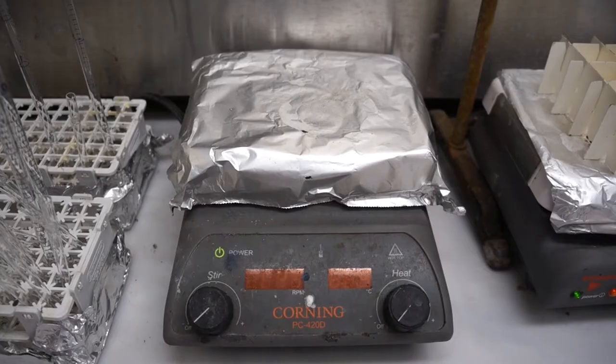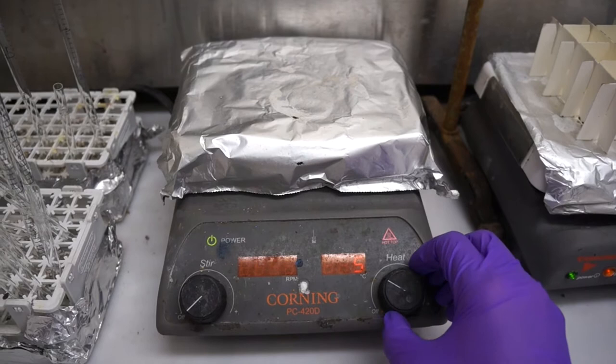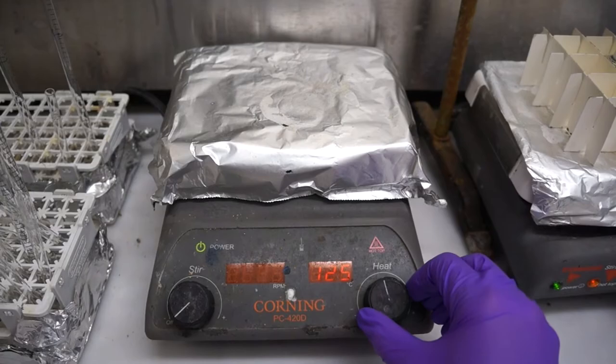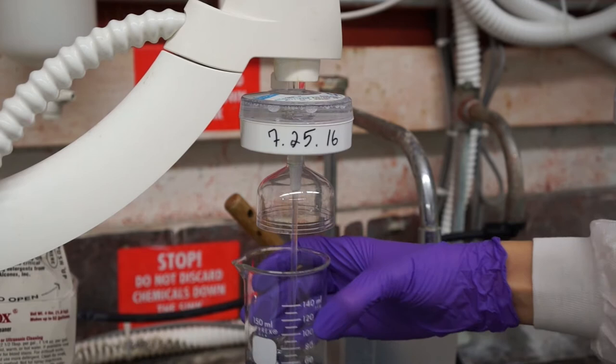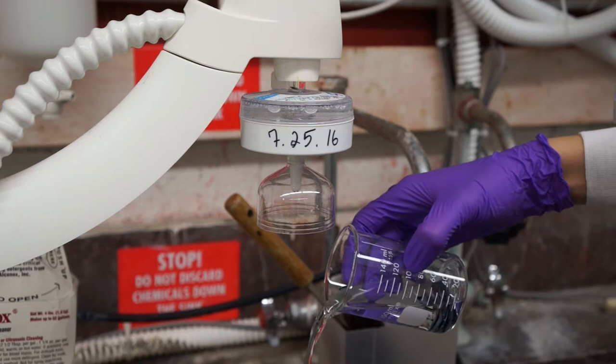With your wafer cut, we can move on to cleaning the pieces. Before starting with any solutions, preheat a hot plate in the hood by setting it to 125 degrees Celsius.